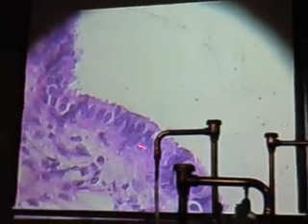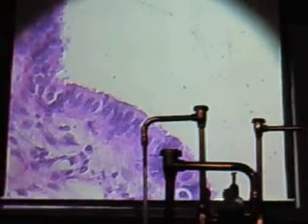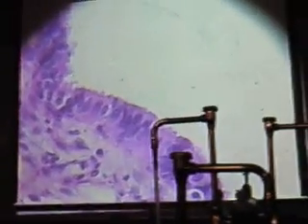Because what happens is what? The reason, and these are tough to find. Okay? This organ is easily destroyed. When you cut it, you lose a lot of stuff. So it's hard to come up with these. Okay? So consequently, what's the function of that cilia? To move the egg down towards the uterus.